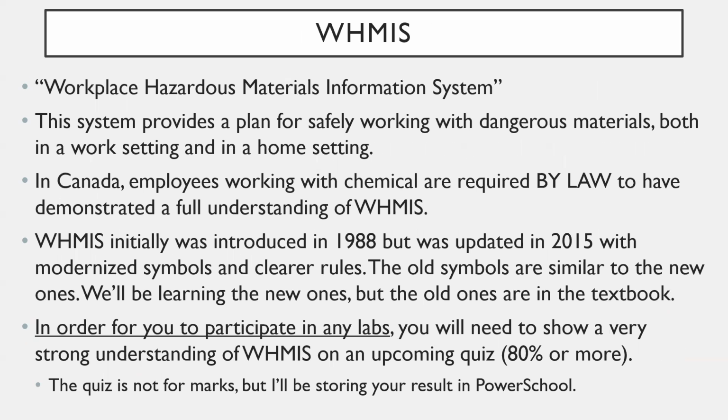Anyway, so WHMIS, this is the big focus of today. This stands for Workplace Hazardous Materials Information System. It's a program that's been around for a while, but it's recently been updated. The system provides a plan for safely working with dangerous materials, both in a work setting and in a home setting.